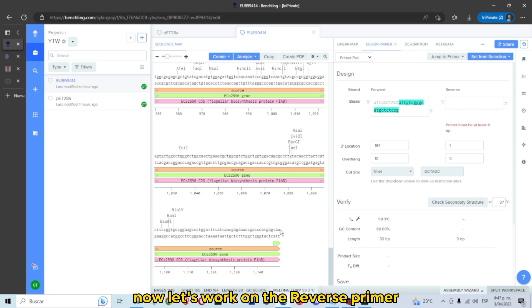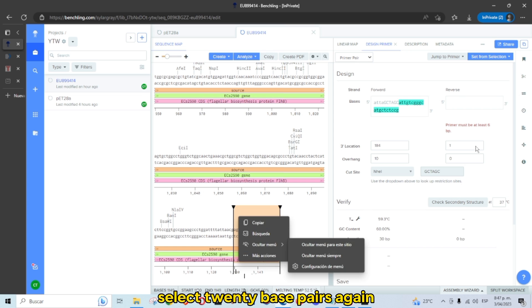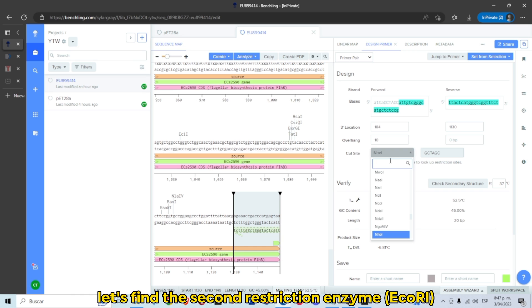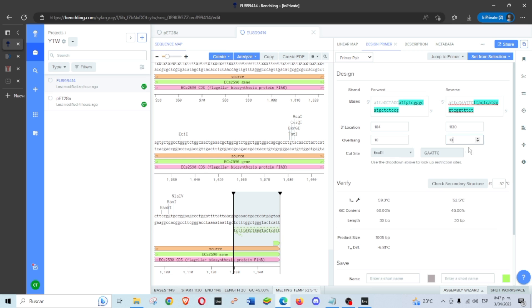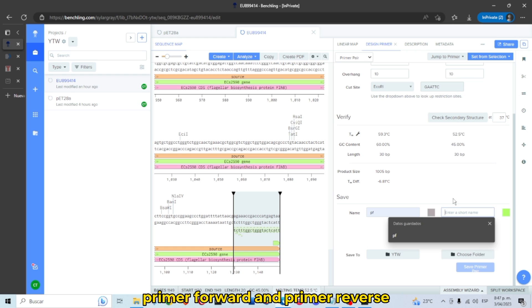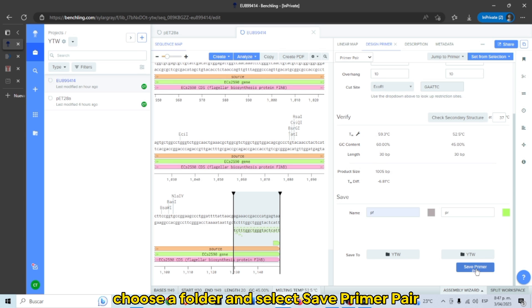Now let's work on the reverse primer. Select 20 base pairs again, then select from selection, Reverse. Let's find the second restriction enzyme — ECO-R1. Increase the overhang. Give it a name: 'Primer Forward' and 'Primer Reverse'. Choose a folder and select Save Primer Pair.